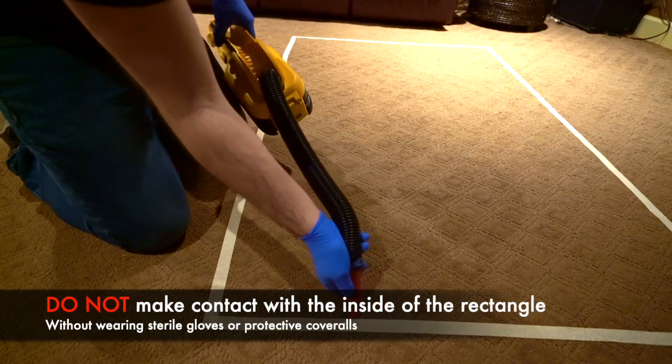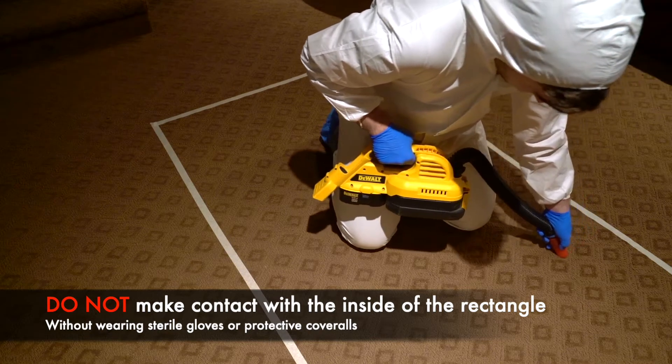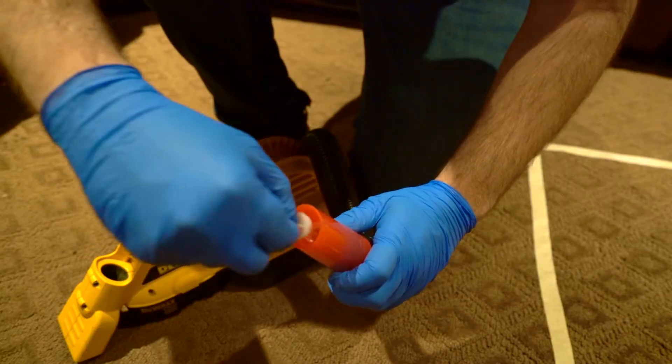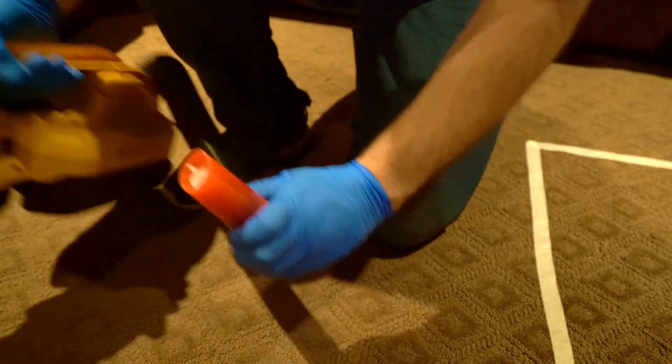Avoid making contact with the inside of the rectangle. If contact must be made, we recommend wearing gloves and or protective coveralls to prevent contamination of the sample. After you finish vacuuming the first area, keep your cassette pointing upwards, reattach your white cap, and move to the second location.